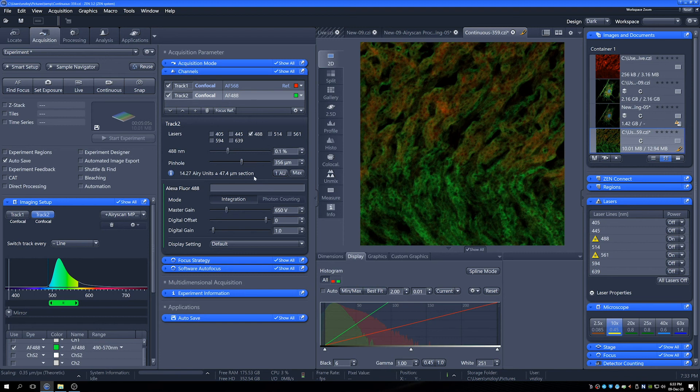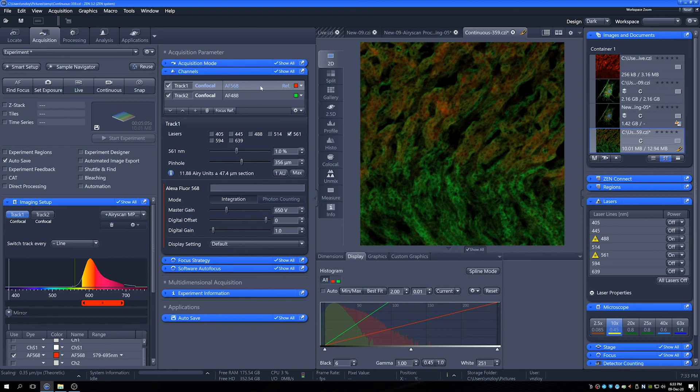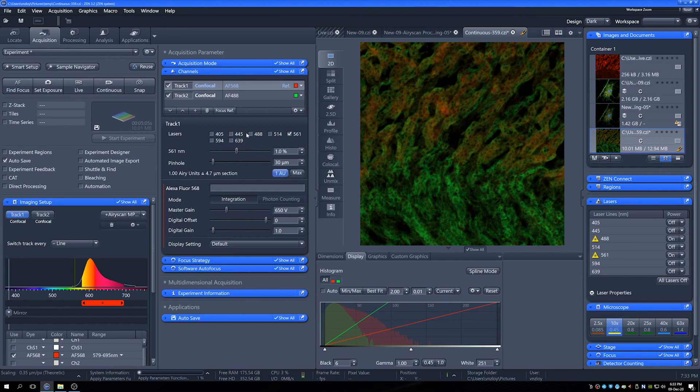But we'll notice that actually our pinhole has not been set yet. So it's wide open as we stand. The normal convention for pinholes is to set them to 1 AU. So this is why we have a 1 AU button here. If I just select that, the normal convention here is that if we're doing a type of imaging that doesn't allow changes of hardware in between channels, so when you're doing line scanning is a good example of that, or line switching even.